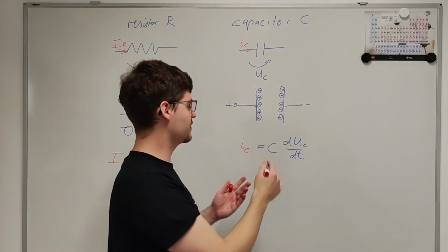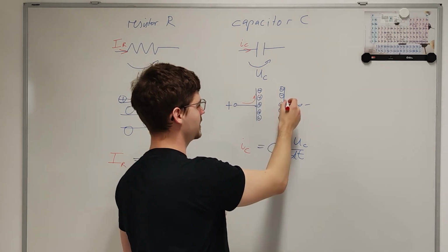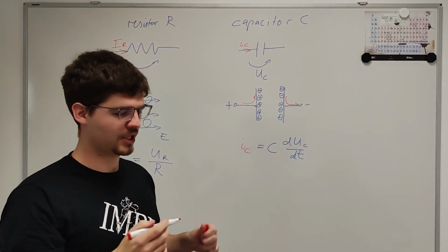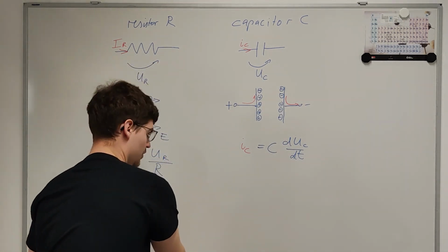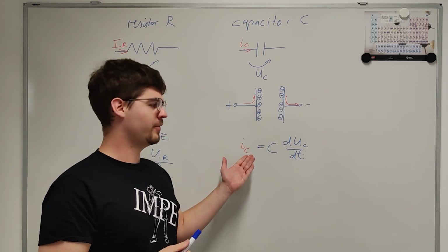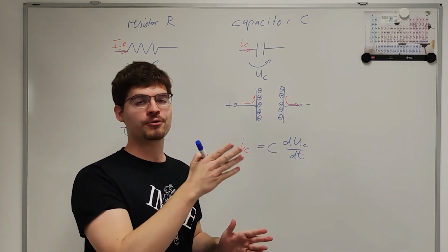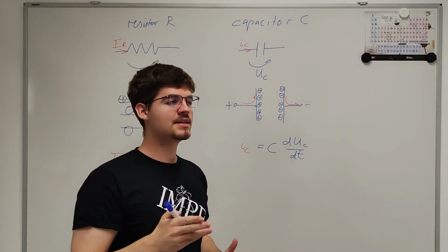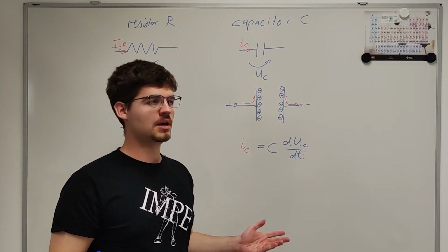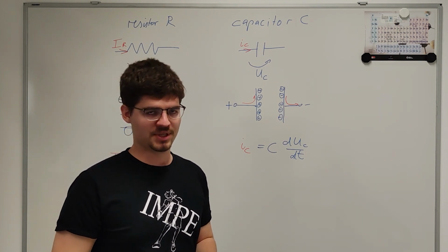And the current that is flowing here, you can imagine this as flowing, for example, here, and from these plates again here, all in the different direction. So, what we have here is different, because the current that flows is not proportional directly to the voltage that is applied, but to the rate of change of the voltage. And this brings with it important changes in the behavior, if we, for example, apply a potential step function, as we do in chronoamperometric experiments.